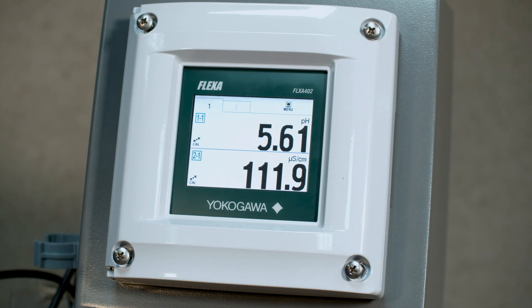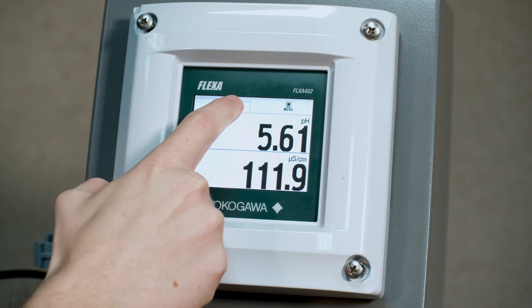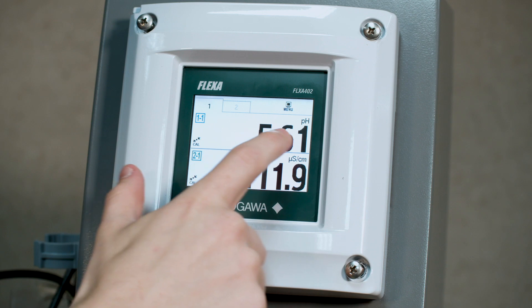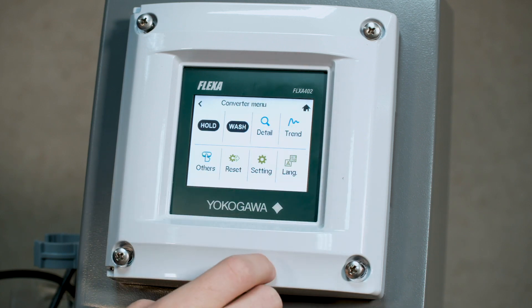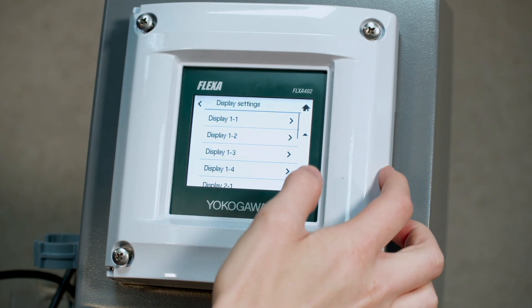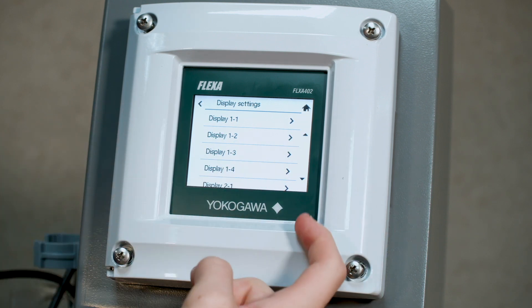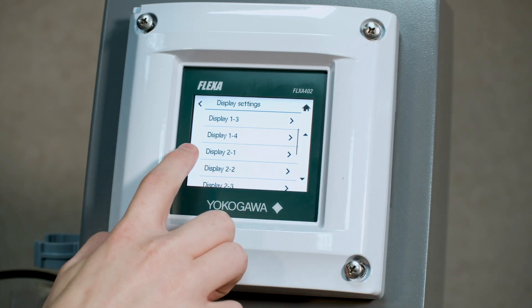So now we're going to show how to use the Flexa 402's HMI to set up for a second sensor through the BA11. You can see we have tab 1 and tab 2 here. These are the first number in the tabs, and we also have quadrant 1, 2, 3, and 4. These correspond when you go to menu, setting, display setting. Quadrant 1, 2, 3, and 4 are the second number, and the first number is the tab that you're under.